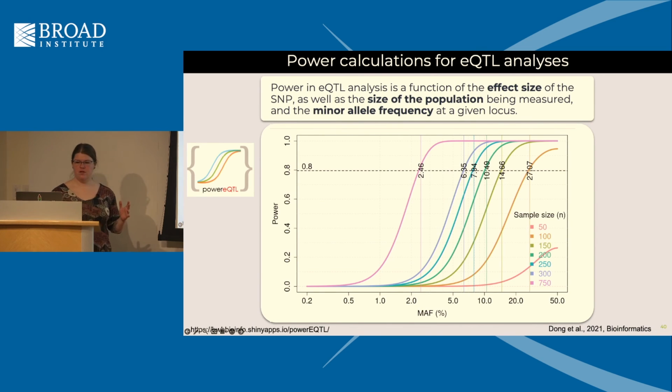The most important thing, and the biggest question I've gotten over a lot of years of watching eQTL analyses grow up, is how many people do I need? And again, this is a dual modality analysis. Ideally you want it all on the same platform, because batch effects can really mess things up for eQTLs, especially if you don't have that many people.